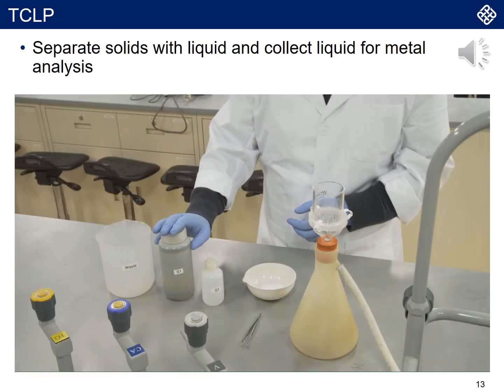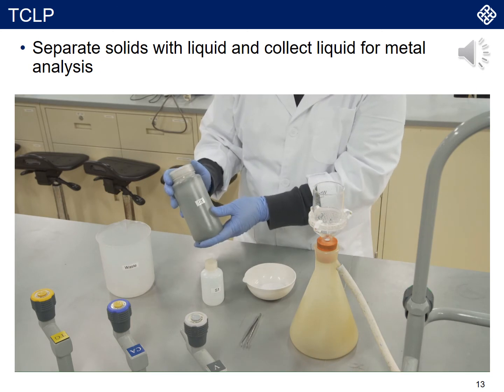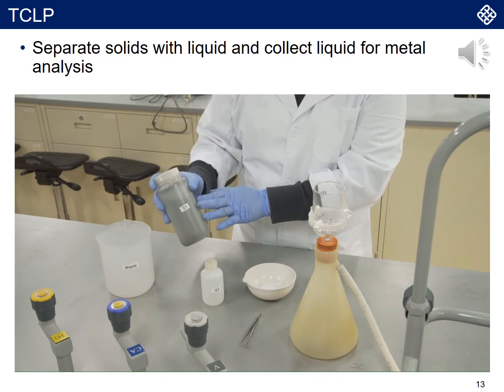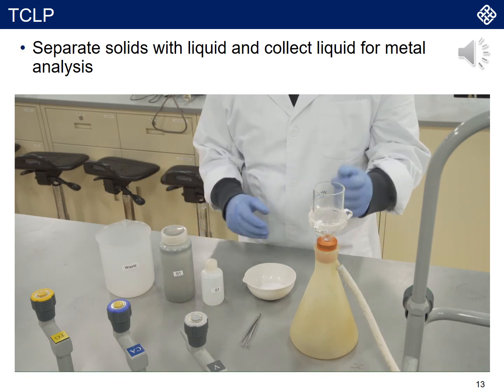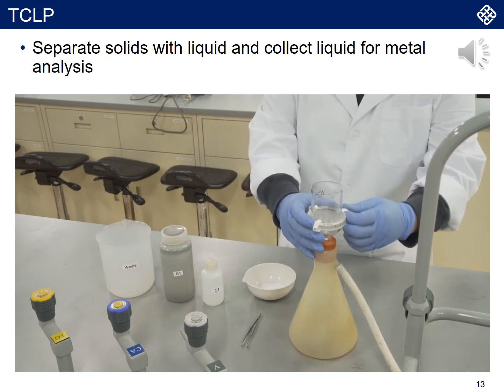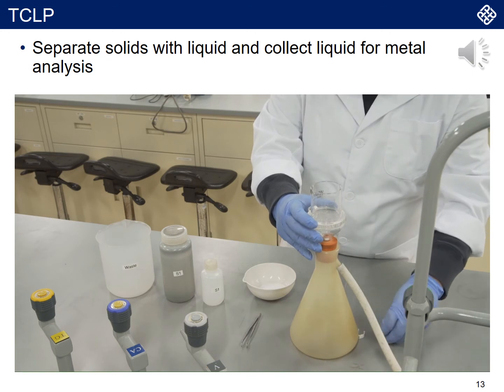Okay, after we mix all the samples, what we need to do is separate the liquid and the solid. Supposedly the solid part is already heavy metal free.